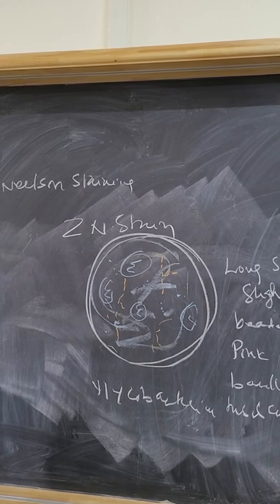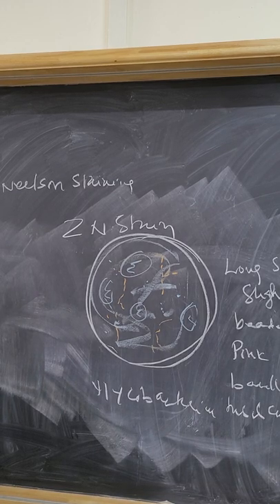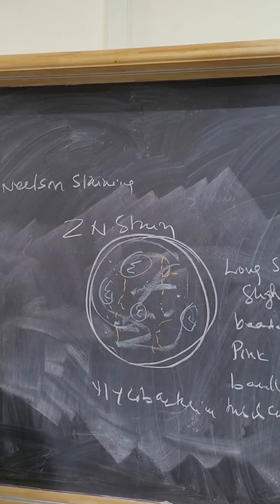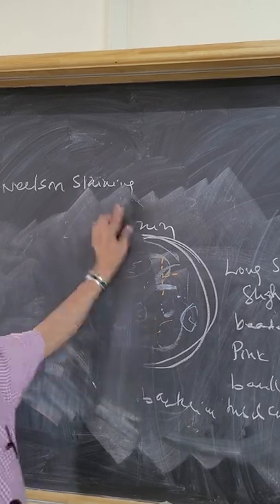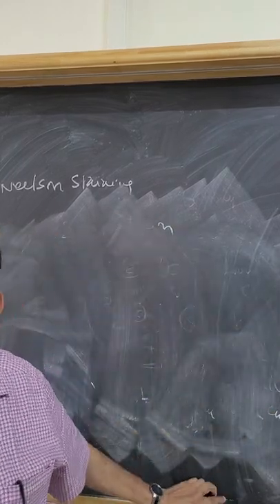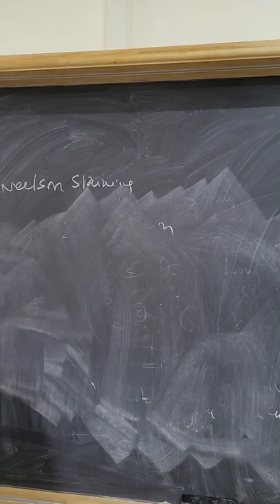Then, once you write that, don't write any procedure in the examination. Just stay with it, write the observation and report. The examiner will come. What will he do? First he will look at you like this.